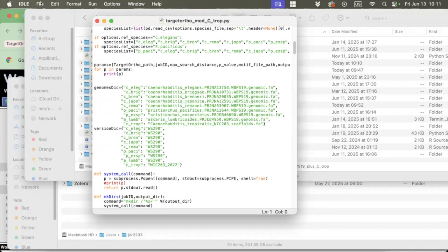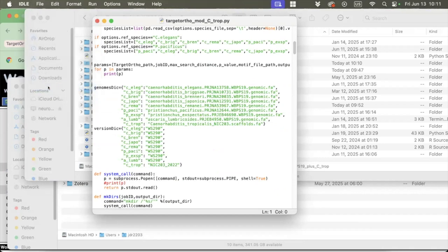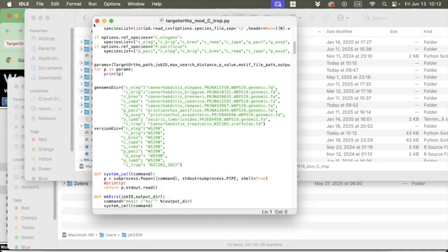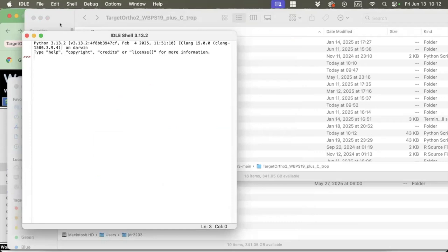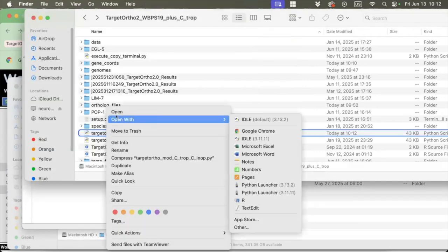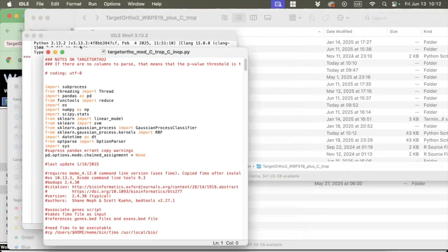Let me go ahead and make a new copy. It's good to make a new copy in case you make a mistake.